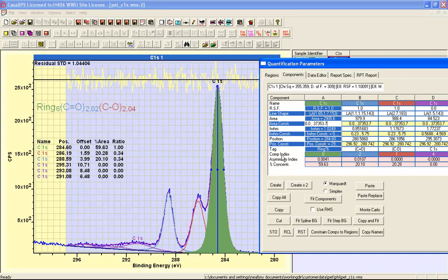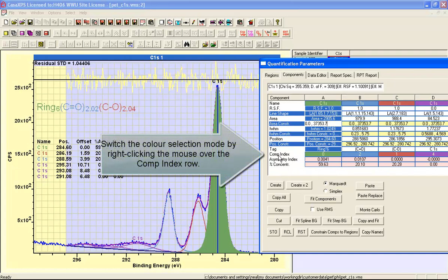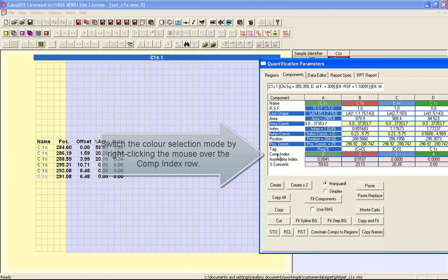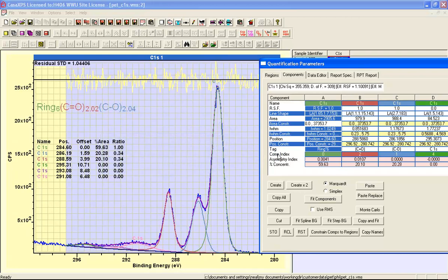We can switch between these colors using the component index row by right clicking. Each time I right click then the color changes.